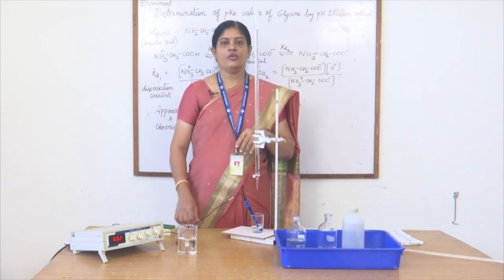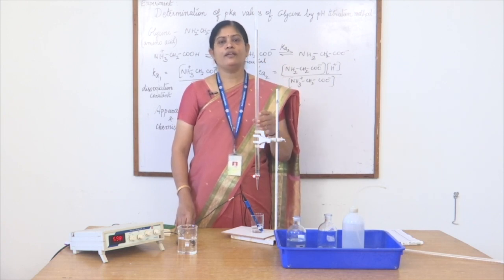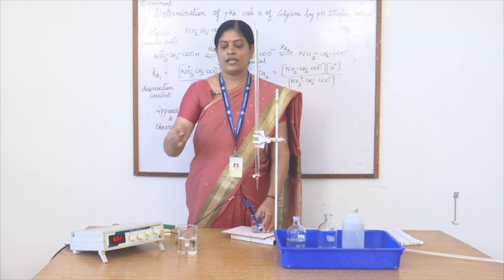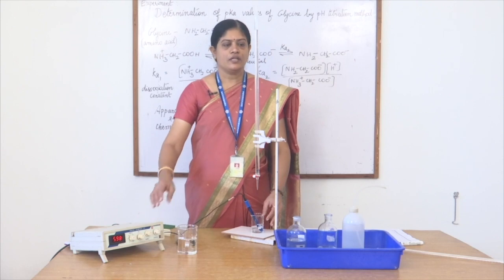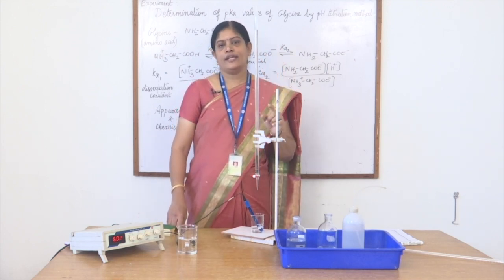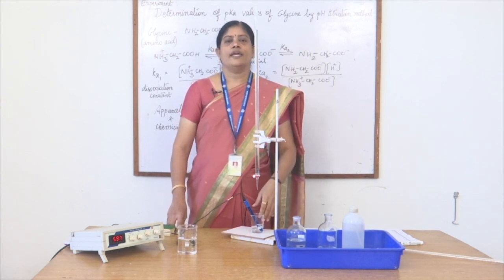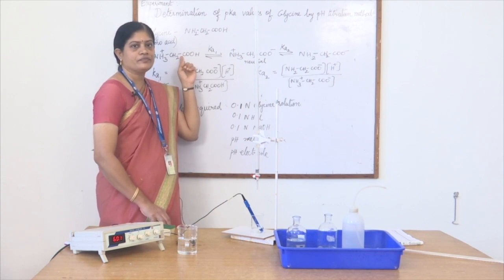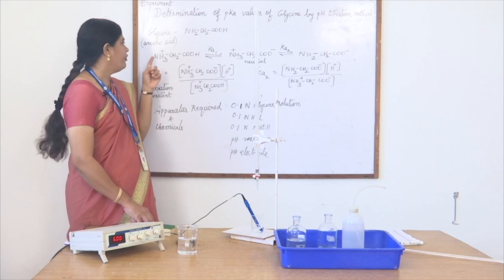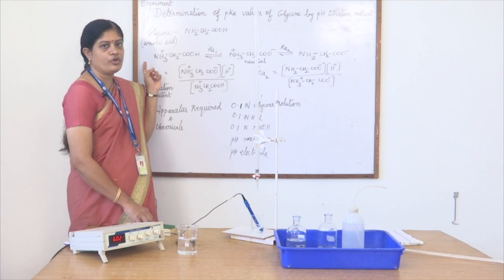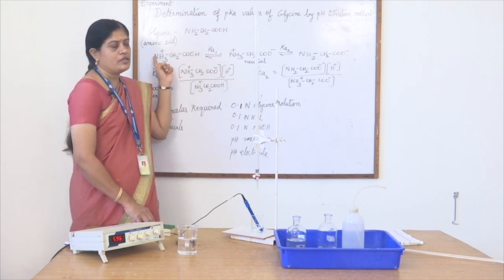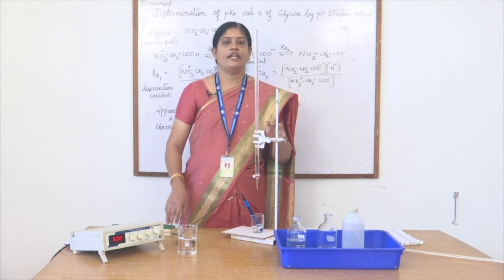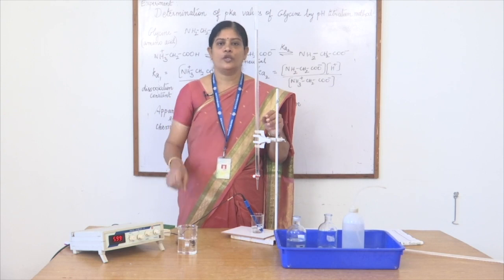The HCl solution is added in 1 ml aliquots each time. After each addition, stir the solution so that the electrode detects the pH, which is displayed as a digital reading on the pH meter. When HCl is added to glycine, the equilibrium shifts to the left, producing the glycineum cation where the amino group undergoes protonation. Continue adding HCl up to 30 ml total volume, noting the pH after each 1 ml addition.